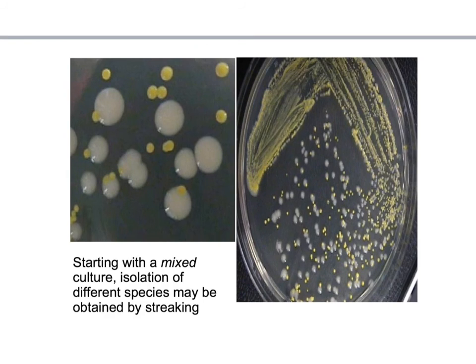Here we have a petri dish that has a mixed culture. We know it has a mixed culture with different species because we can see the difference in the colonial characteristics. We can see the yellow colonies representing one type of bacteria.